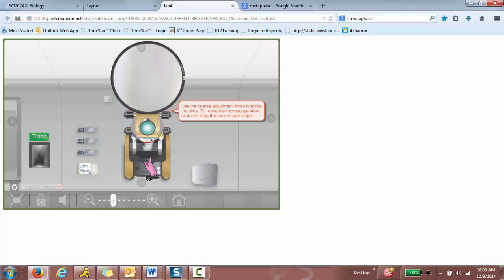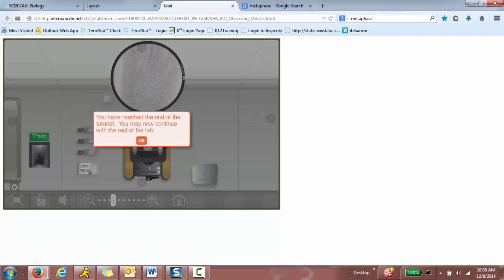I think there's something there. And then I'm going to click and scroll up or down. Oh, oh, right there. You have reached the end of the tutorial.